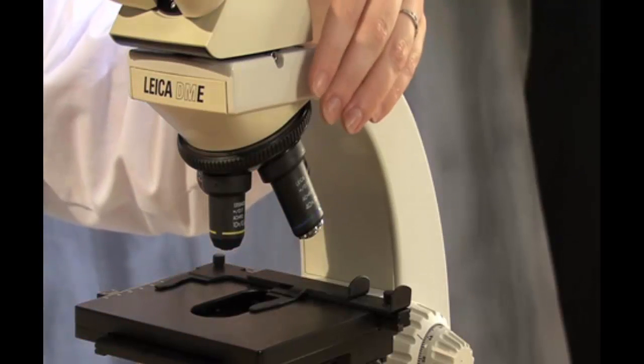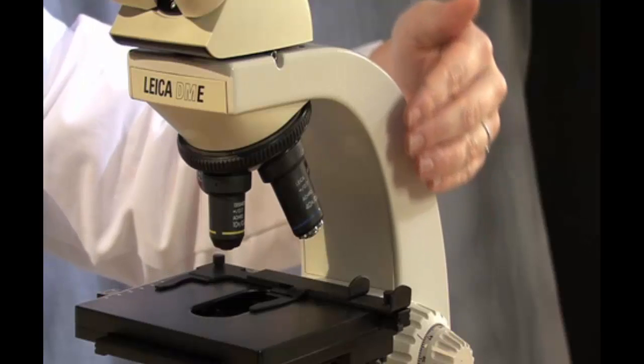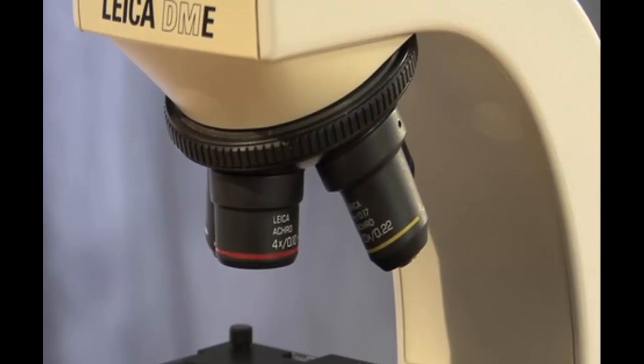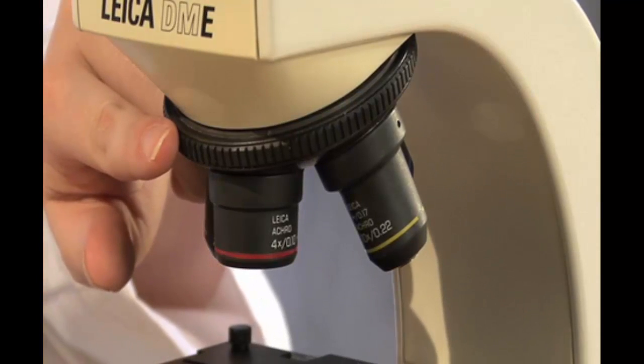Moving further down the microscope, we see the arm and attached to it is the entire magnification system for the scope. The system includes the revolving nose piece, which contains the four objective lenses.